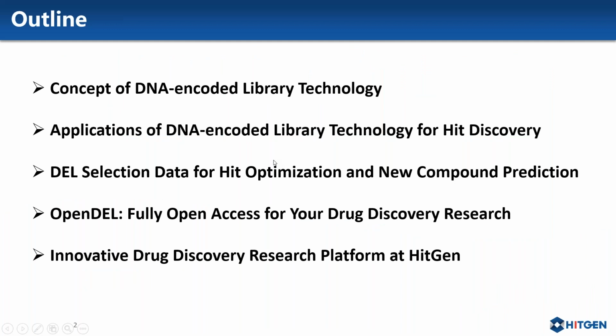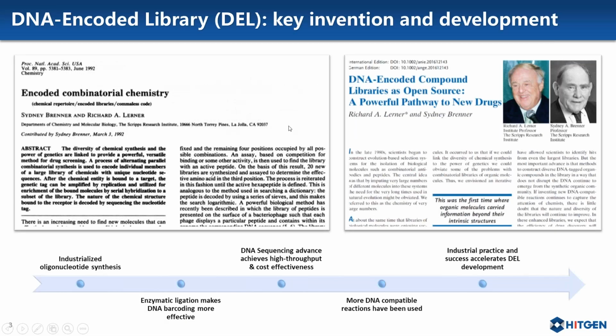So my presentation today is divided into 5 main sections. First, let's begin with a brief introduction on the concept of DNA-encoded library technology. So DNA-encoded chemical library is often abbreviated as DEL.